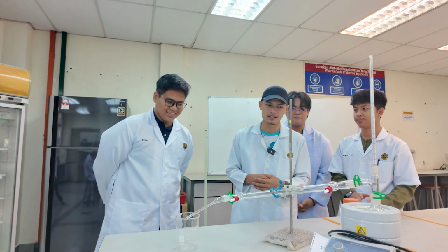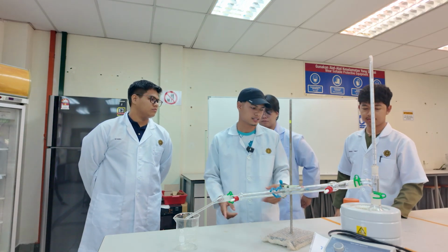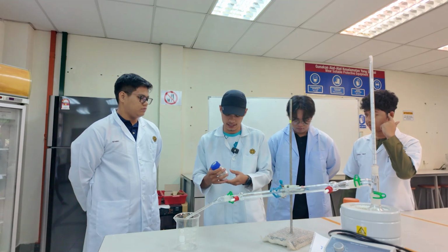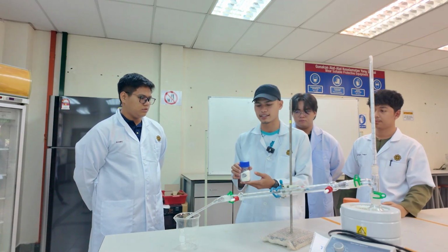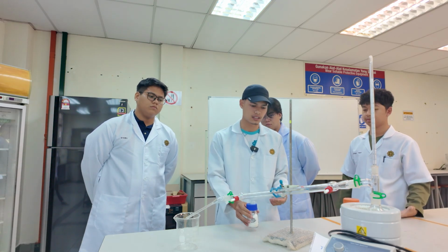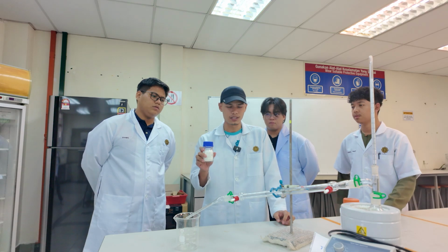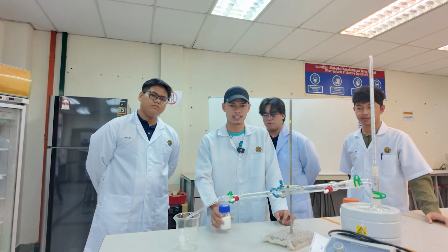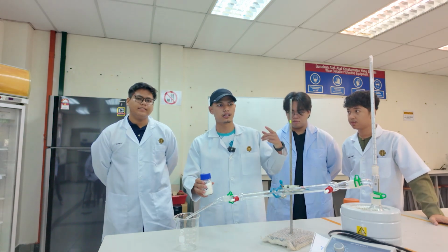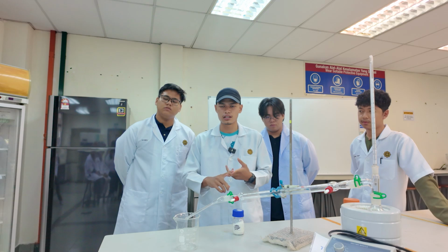So I will explain about the precaution, the industrial application, and some examples. The precaution that I want to mention is using anhydrous sodium sulfate to remove excess water, to remove the traces of water. Why do we use anhydrous sodium sulfate? Because it can create bonds to form salt with water.